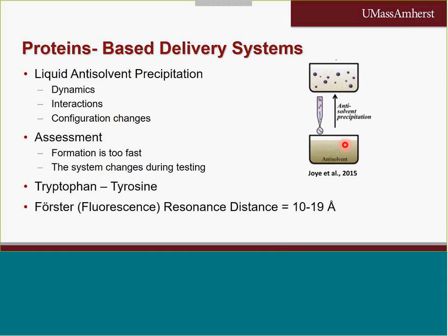One of the things that happens is that the measurement of the formation mechanisms is a little bit cumbersome to follow, because the formation is too fast and the system shifts during testing.